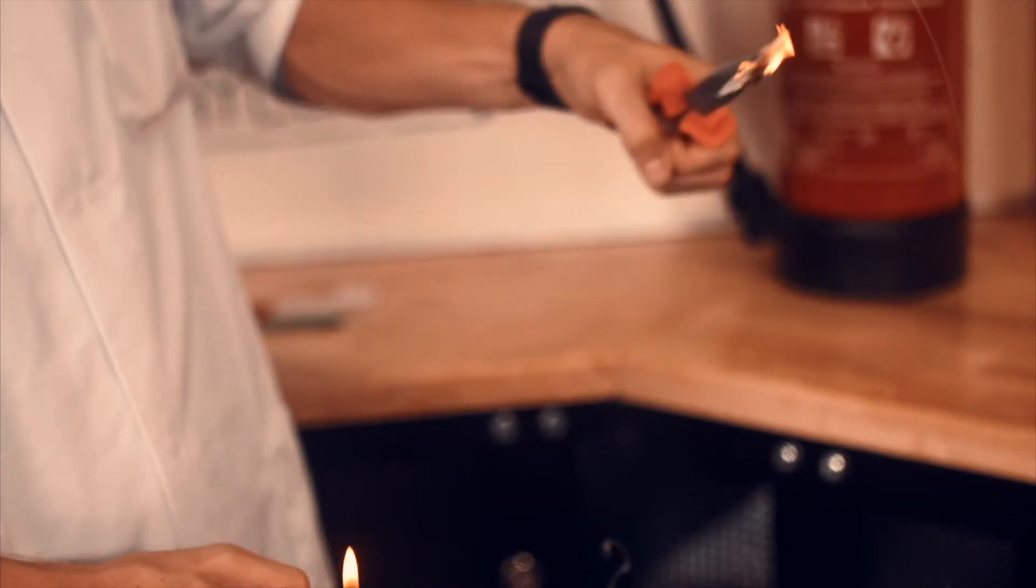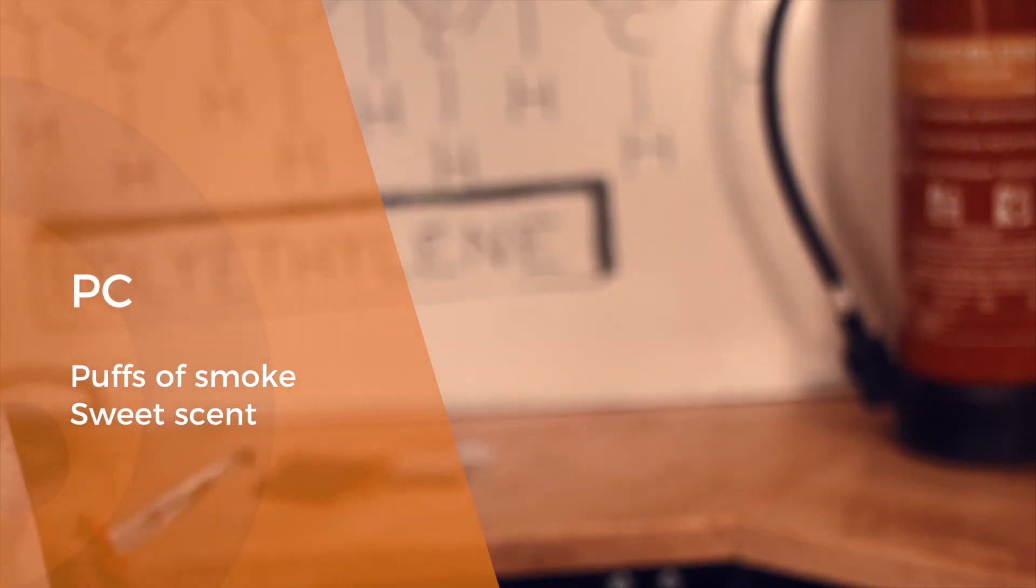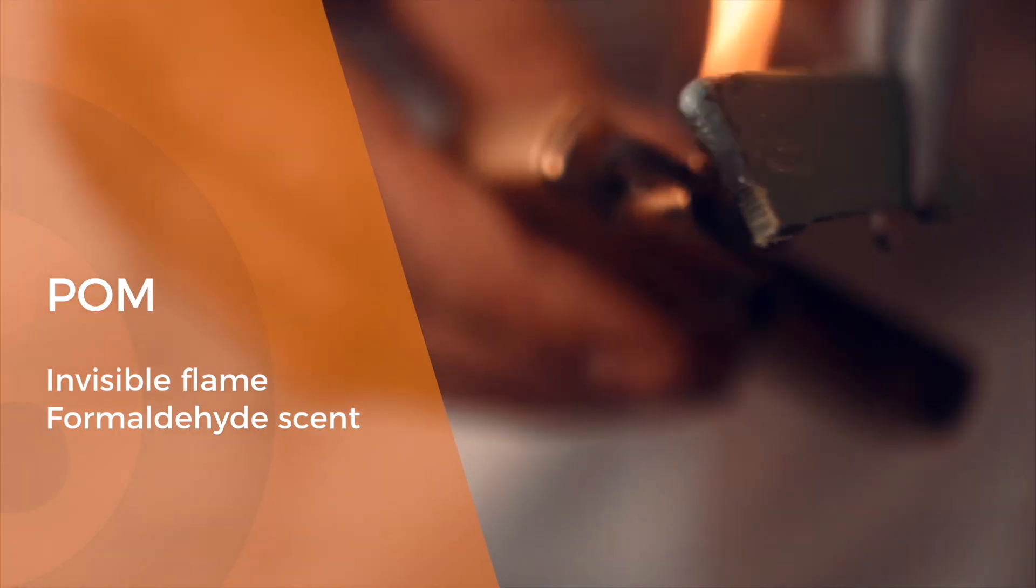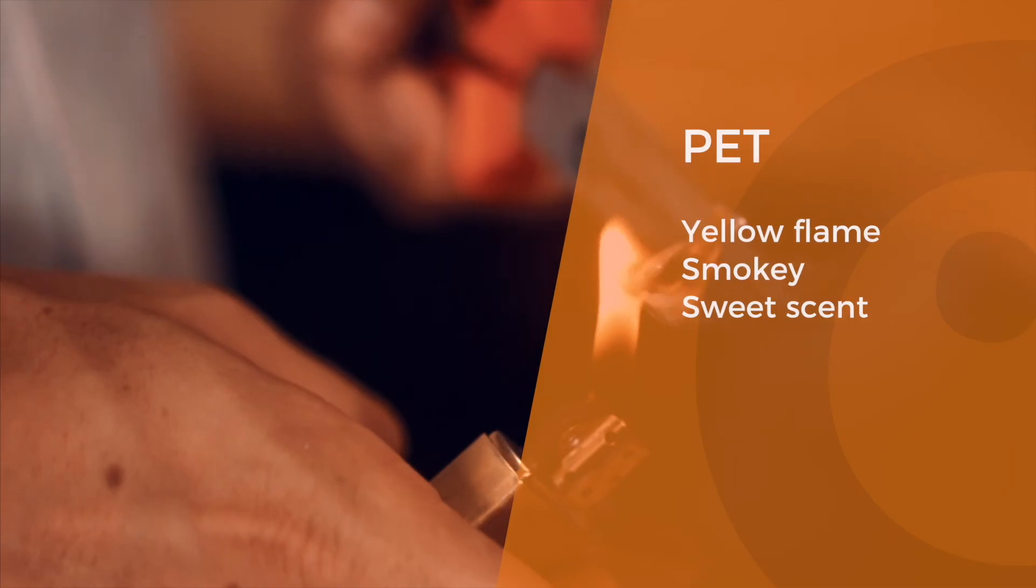PC will light up with puffs of smoke. The resulting smell is relatively sweet. POM flame is almost invisible with a strong scent of formaldehyde. Finally, PET results in yellow and smoky flames.